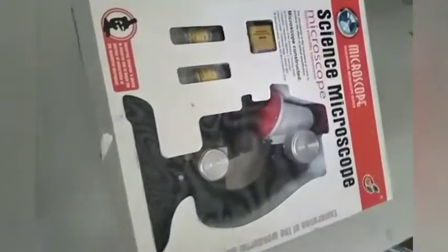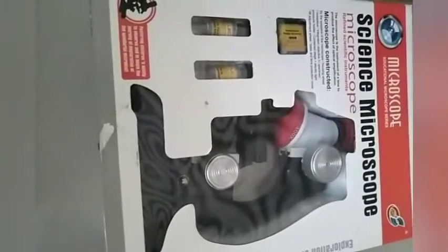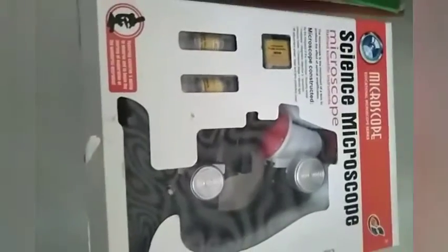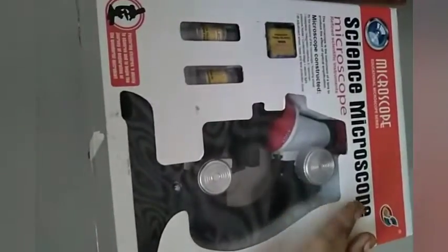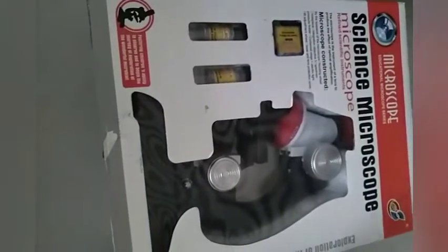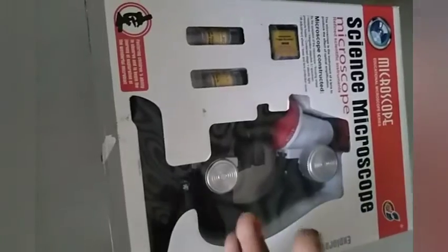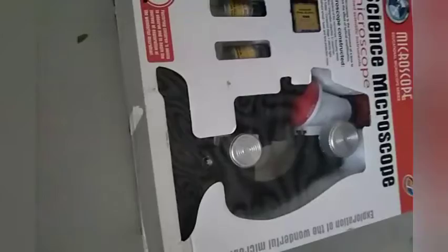It is very nice if you are using it just for observing things or for school activities. For school students and beginners it will be very useful. If you get the paper microscope, it costs at least 300 rupees — but this is just 600 rupees, only 300 more. Instead of a paper microscope you can get this, which is much nicer. I love this microscope very, very much.